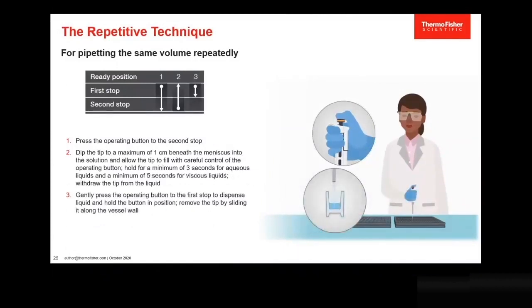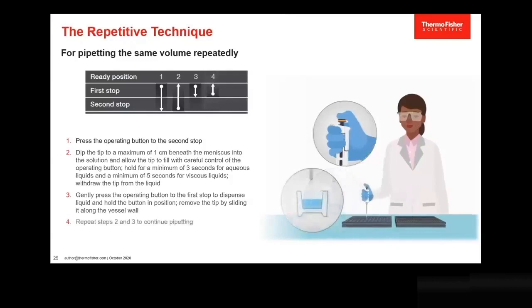Gently press the operating button to the first stop to dispense the liquid and hold the button in position. Remove the tip by sliding it along the vessel wall. Repeat steps two and three to continue pipetting.